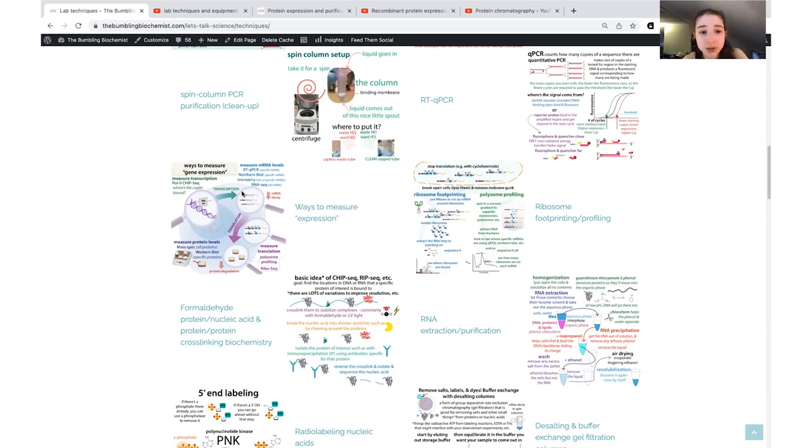These RNAs, though, are then subject to regulation. So you can have regulation at the decay level, and you can have regulation at the translational level. You can measure translation with methods like polysome profiling and riboseq. Riboseq is sometimes called ribosome footprinting. You stop translation, such as with cycloheximide, then you break open the cells and remove the membrane gunk. And then you use RNases, RNA-cleaving enzymes, to cut up around the ribosomes, so that you isolate the sequences that they're bound to. Then you can extract the RNA that they were standing on and sequence it and see where they were bound.